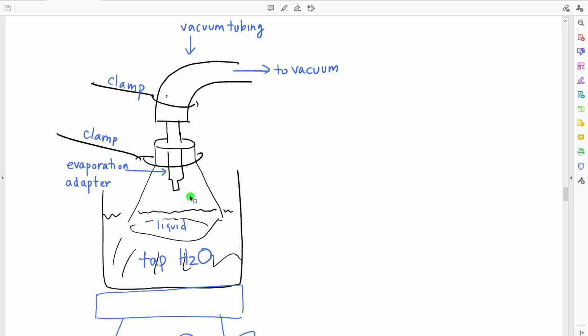Now, when the liquid is left in contact with the atmosphere, vapor will naturally come off of the liquid because of the vapor pressure. The process of evaporation then involves leaving that container open to the atmosphere so that the vapor will come off the liquid and exit the container out into the larger system of the universe.